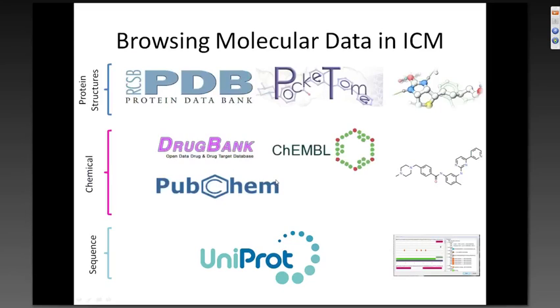So let's see what kind of information you can bring into ICM. You can read protein structures directly from the Protein Data Bank, the PDB, or the Pocketome. The Pocketome is a database provided by UCSD, Ruben Abagyan's lab.